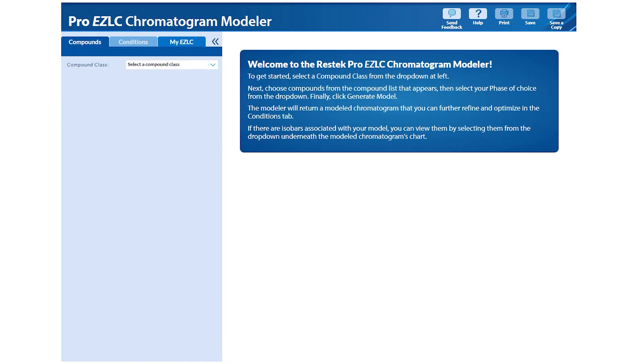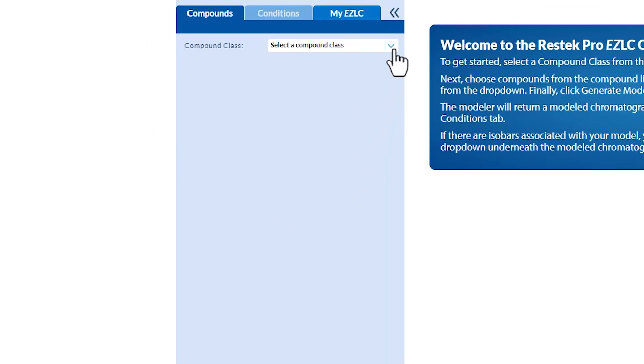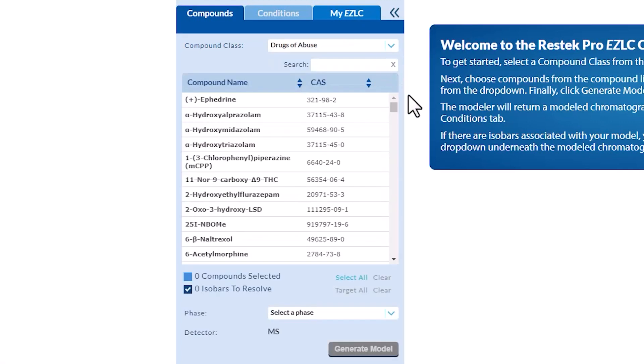When you first access the Pro-Easy LC Modeler, you will start in the Compounds tab. You can choose from specific libraries of the compounds that have been developed by the expert chromatographers here at Restek. In this demonstration, we're going to select the Drugs of Abuse library. A table of compounds will now appear.